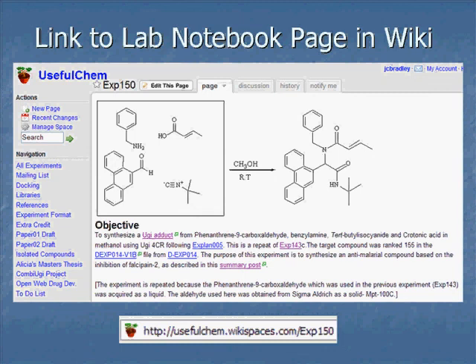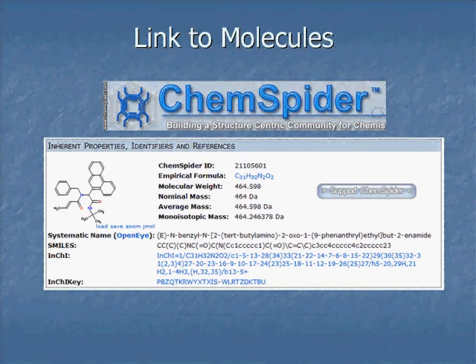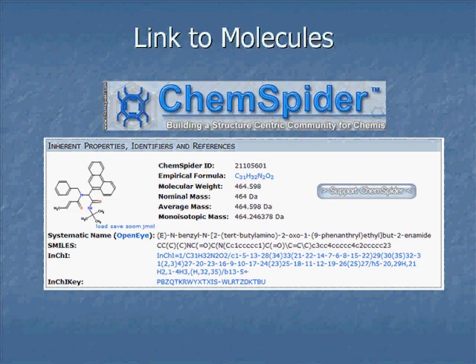I click on experiment 150 and it shows me the scheme and gives me the objective. If I click on one of the links for the compound, it takes me to ChemSpider. ChemSpider is a free database with about 20 million compounds. It's very handy for an organic chemist because it automatically gives you the InChIKey, the InChI, and the SMILES — you can search by all of these and do substructure searches. If we keep our compounds on ChemSpider, I don't have to run software on my machine to do substructure searches, which I prefer because I'm an organic chemist and I don't want to be managing software.